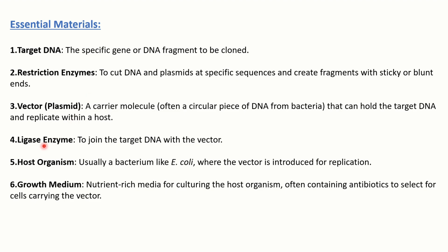Then we need ligase enzyme to join the target DNA with the vector. We need a host organism: in case of prokaryotes, bacteria like E. coli, or in case of eukaryotes, yeast cells, mammalian cells, or plant cells are used. Then we need growth medium.